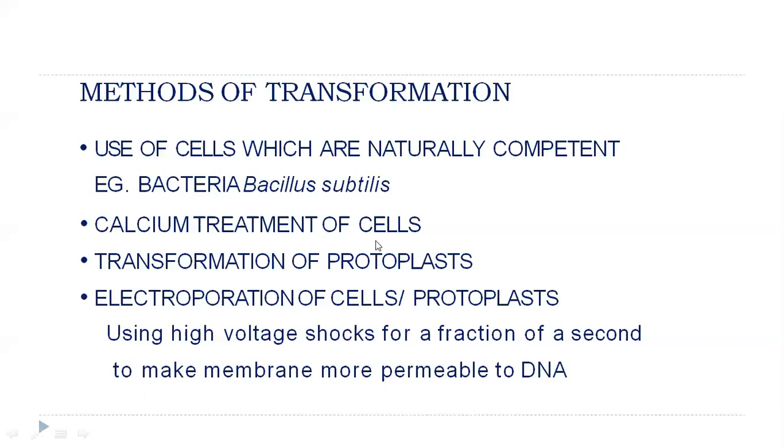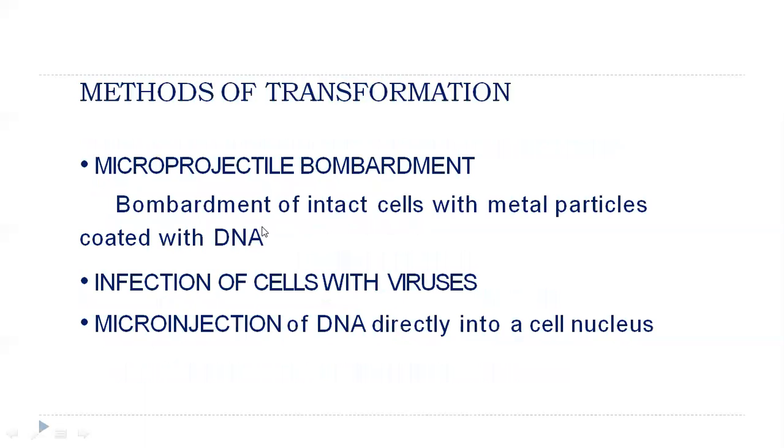It's very easy, and the competency level is very high in case of calcium treatment of the cell.